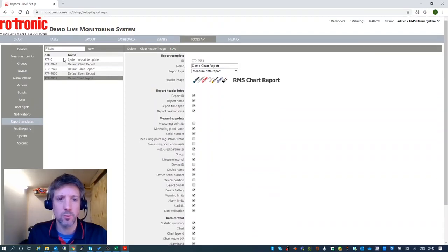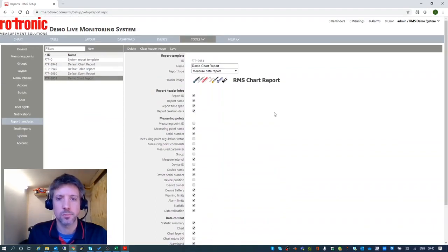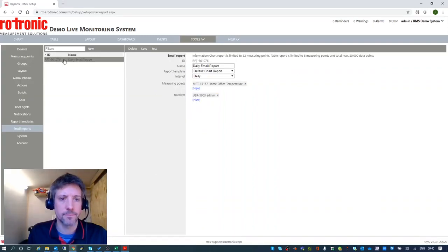That's my chart report. I could do another one as a table report and configure this. There's event reports as well. But that's it for now. Email reports I've actually already configured. We've got a daily email report here.